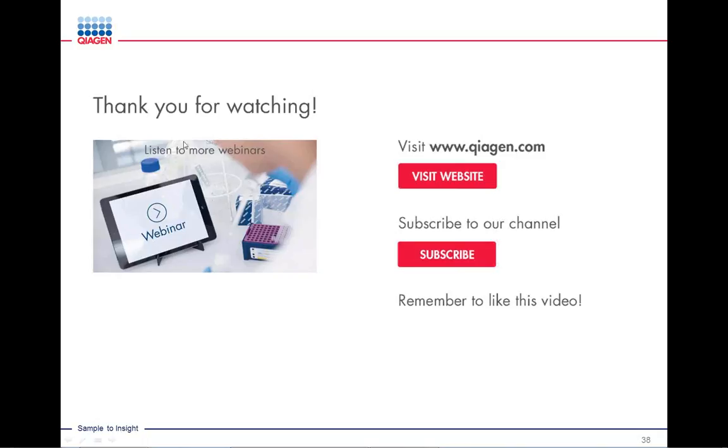Before pooling, how can I quantitate libraries? There are a couple of ways. We always recommend qPCR because that is the most sensitive quantification method. You could use the QIASeq library quantification kits for quantifying RNA libraries or libraries from the RNA panels. But if you don't want to invest 3 hours, you can also use the QIAxcel or bioanalyzer from Agilent to do the quantification. But we always recommend qPCR as a way to quantify libraries.